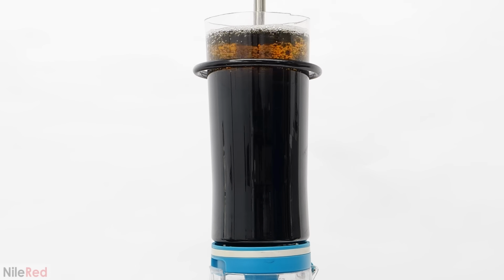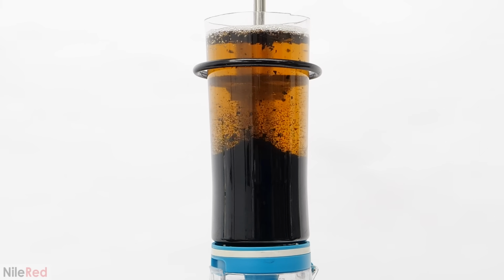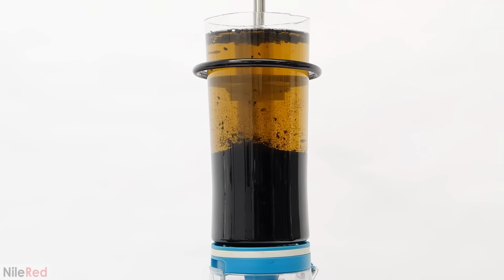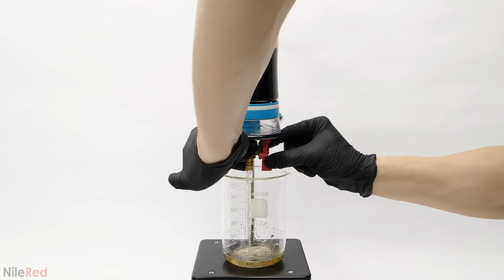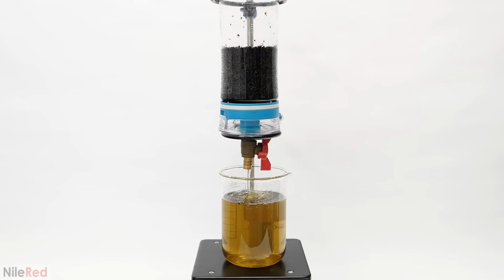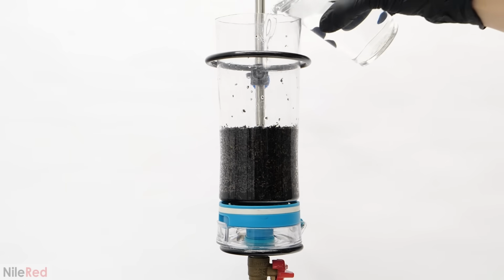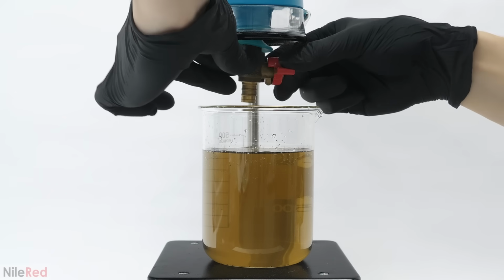I wasn't sure how long I had to leave it, and based on almost nothing, I decided that 5 hours was probably good. Over that time, I just randomly stirred it every so often, and it did get noticeably lighter. When it hit the 5 hour mark, I opened the valve and I drained everything out. I washed everything with a bit of extra water, and it was now hopefully cleaner.